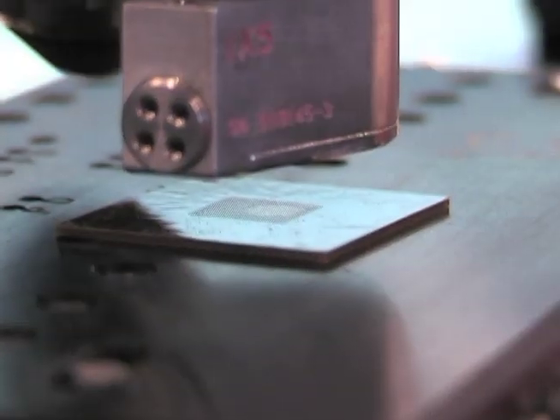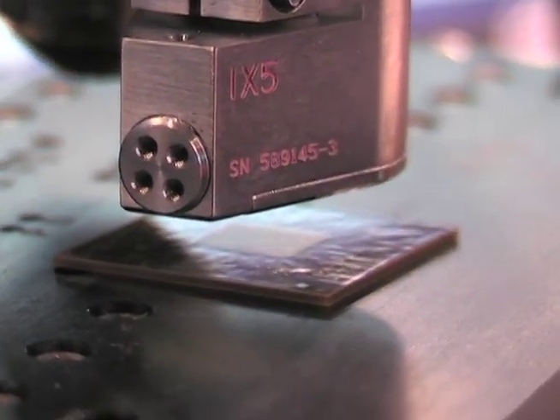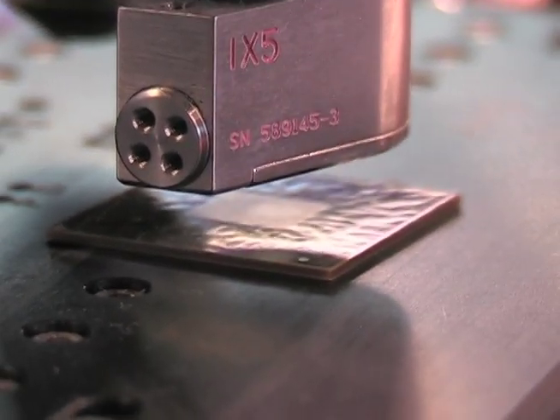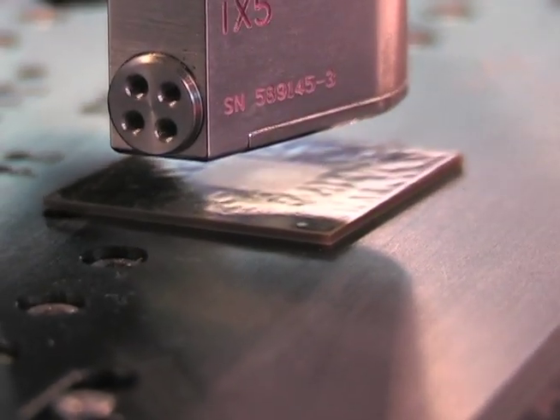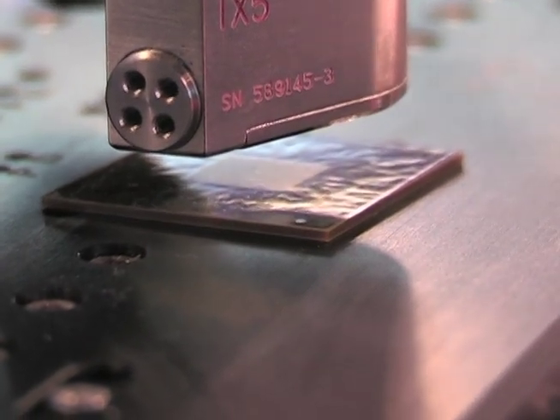On the stage right now we have a semiconductor sample that's mounted, and that sample has some bumps on it which are about 30 microns in height. I have it set up so that we can quickly do a measurement — we'll scan through the surface and then very quickly end up with a 3D topographic map.